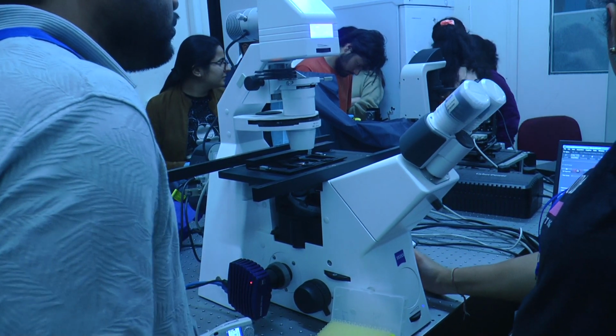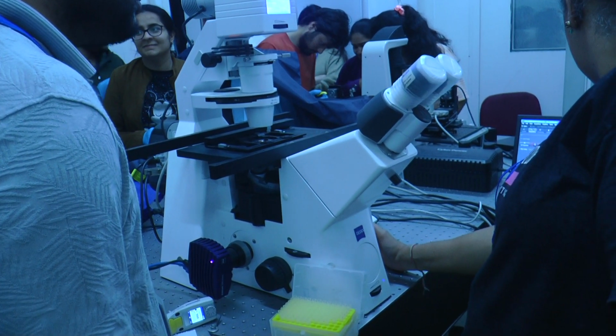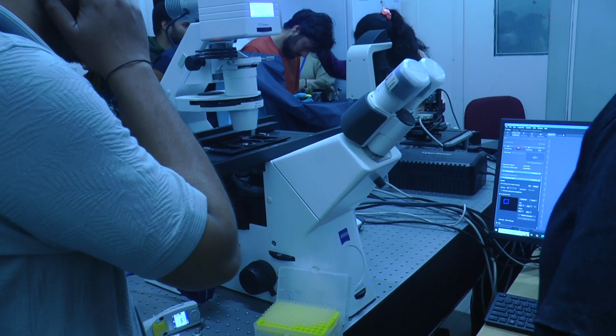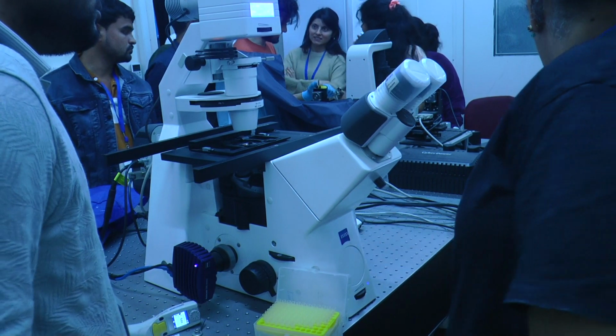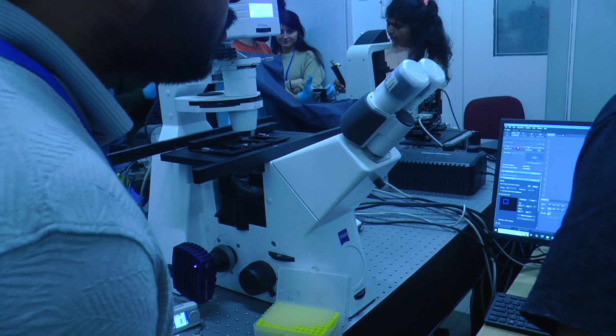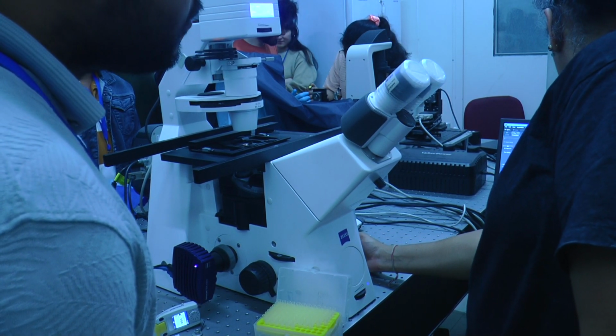Please don't touch the paper. You can just touch the glass, it's not a problem. Is this the second or third? 0.9. 0.9, I'm taking the sample.